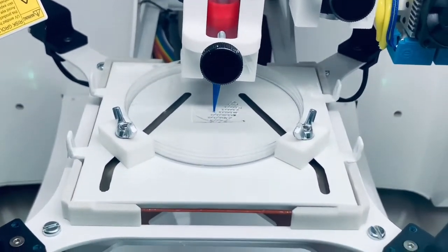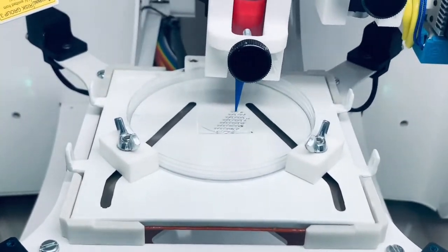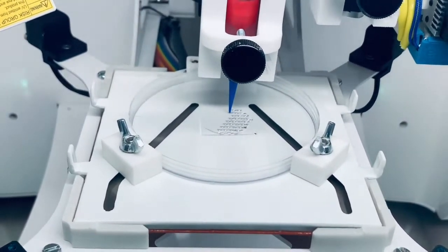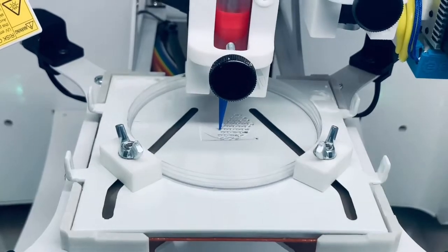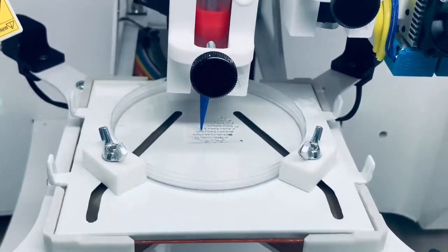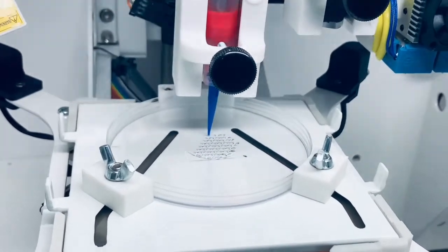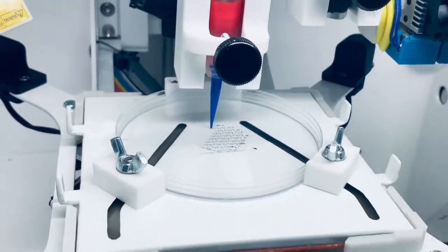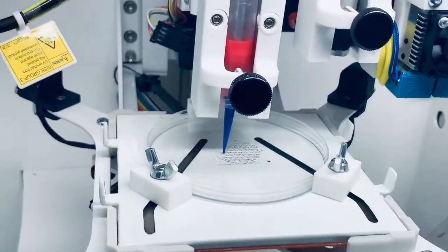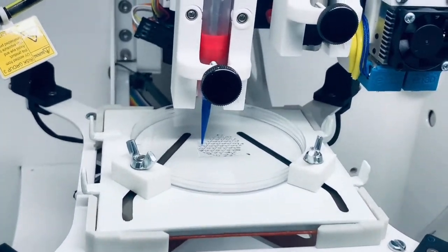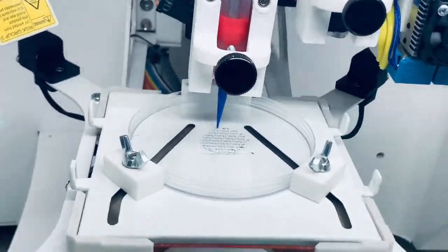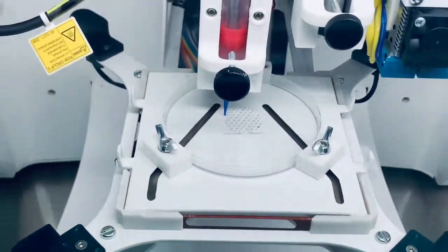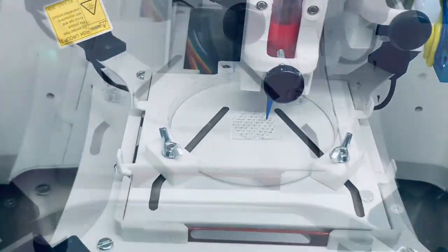As I mentioned before, you can print any type of structure according to the tissue of interest and the needs of your project. In fact, our bioprinting systems have been now validated by researchers in more than 25 countries, working in a wide variety of research lines including biomaterials development, skin bioprinting, bone and cartilage regeneration, and also 3D models of cancer.